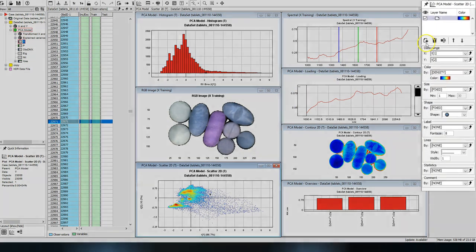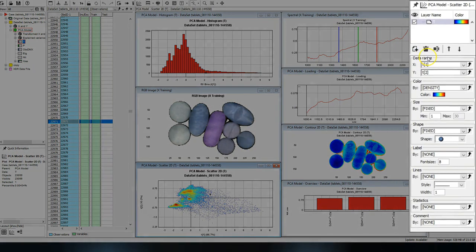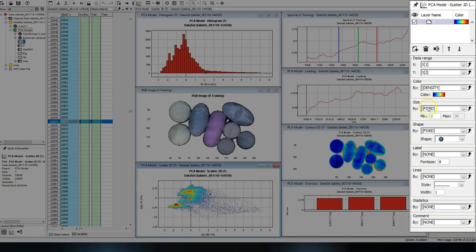Here you can for example change what data should be used for the plot, what coloring, and what labeling should be used.